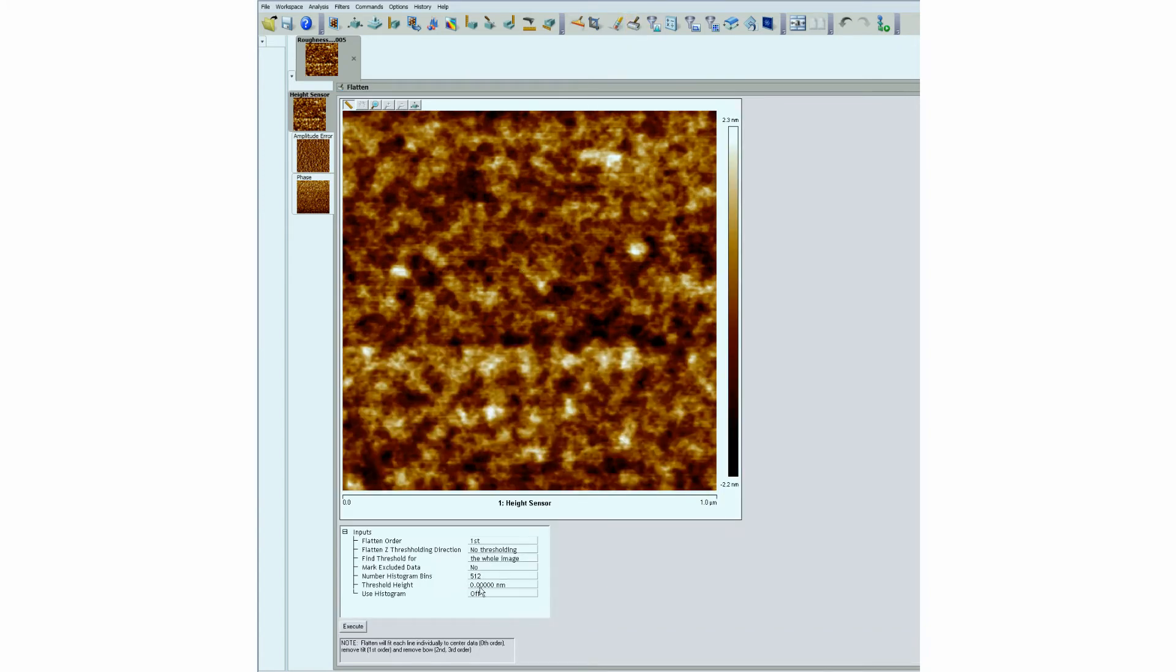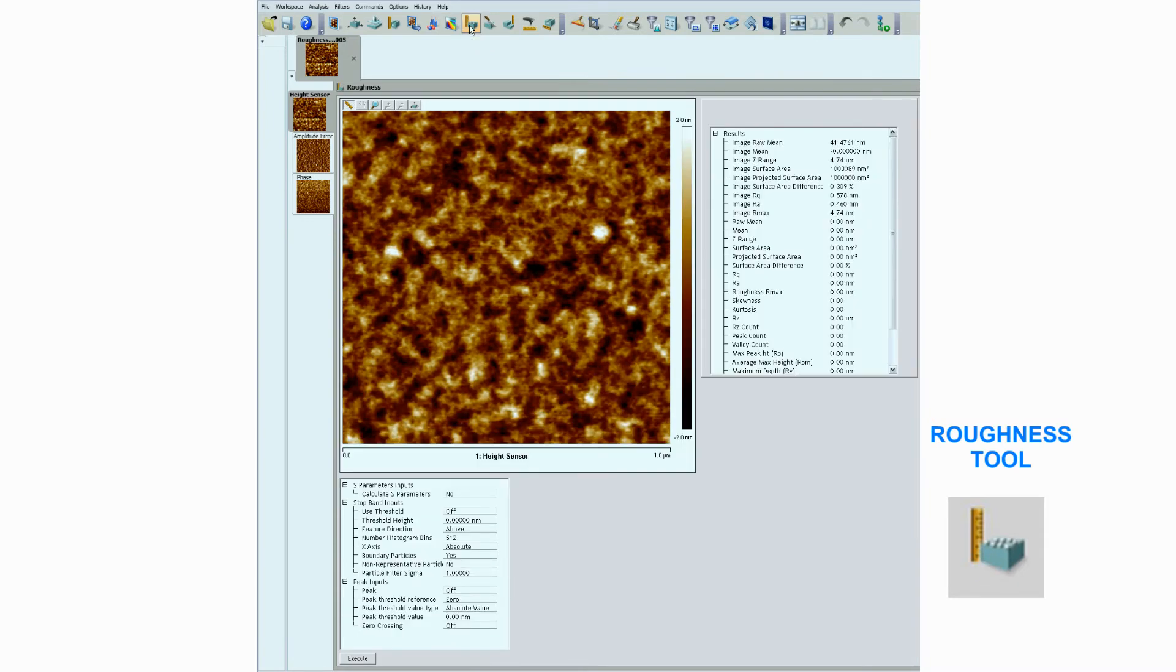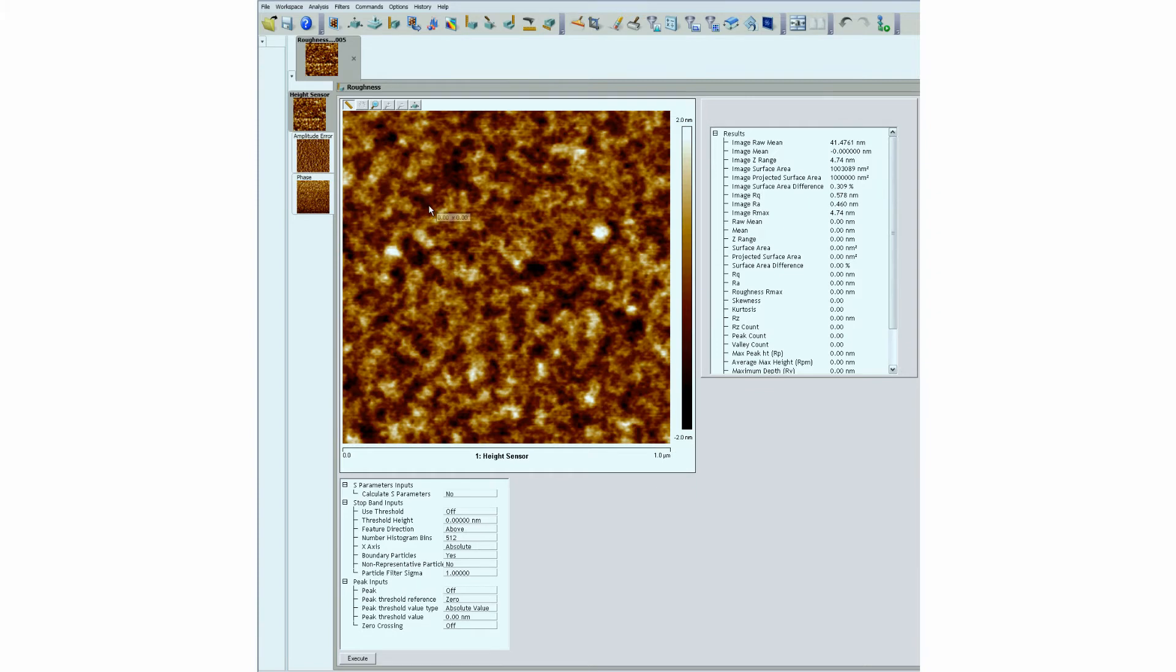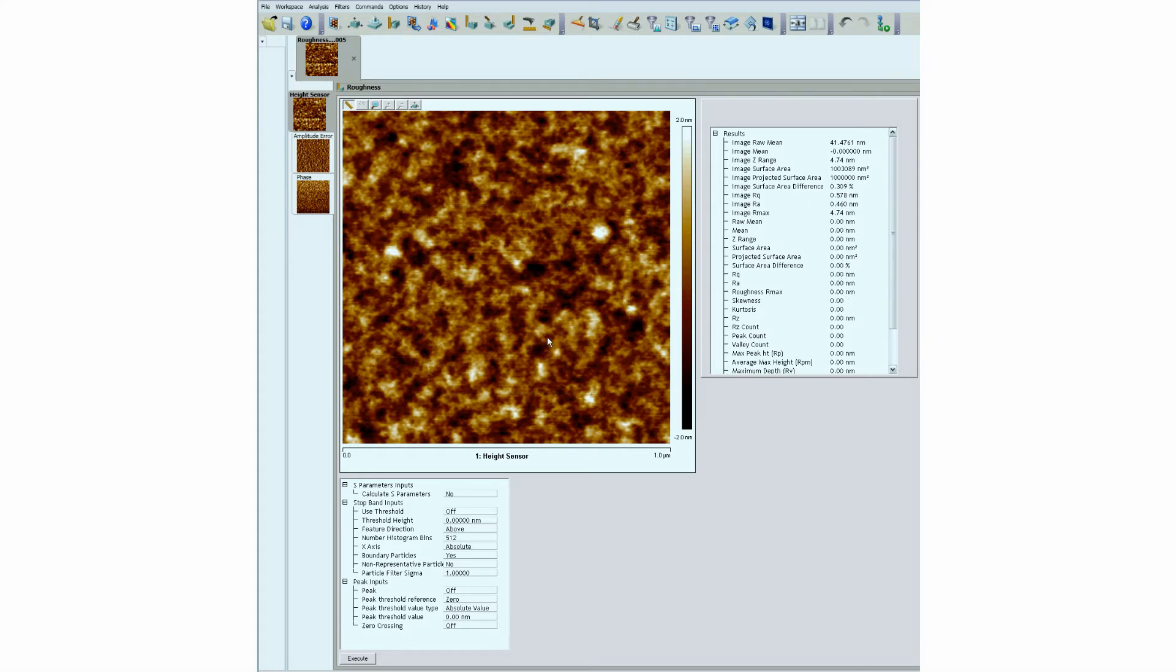After leveling the image, we can generate statistical topographic data using the Roughness command, which provides multiple expressions of the pixel height averaged across the entire image or within defined areas. The user can also selectively exclude areas of the image to eliminate anomalous features.